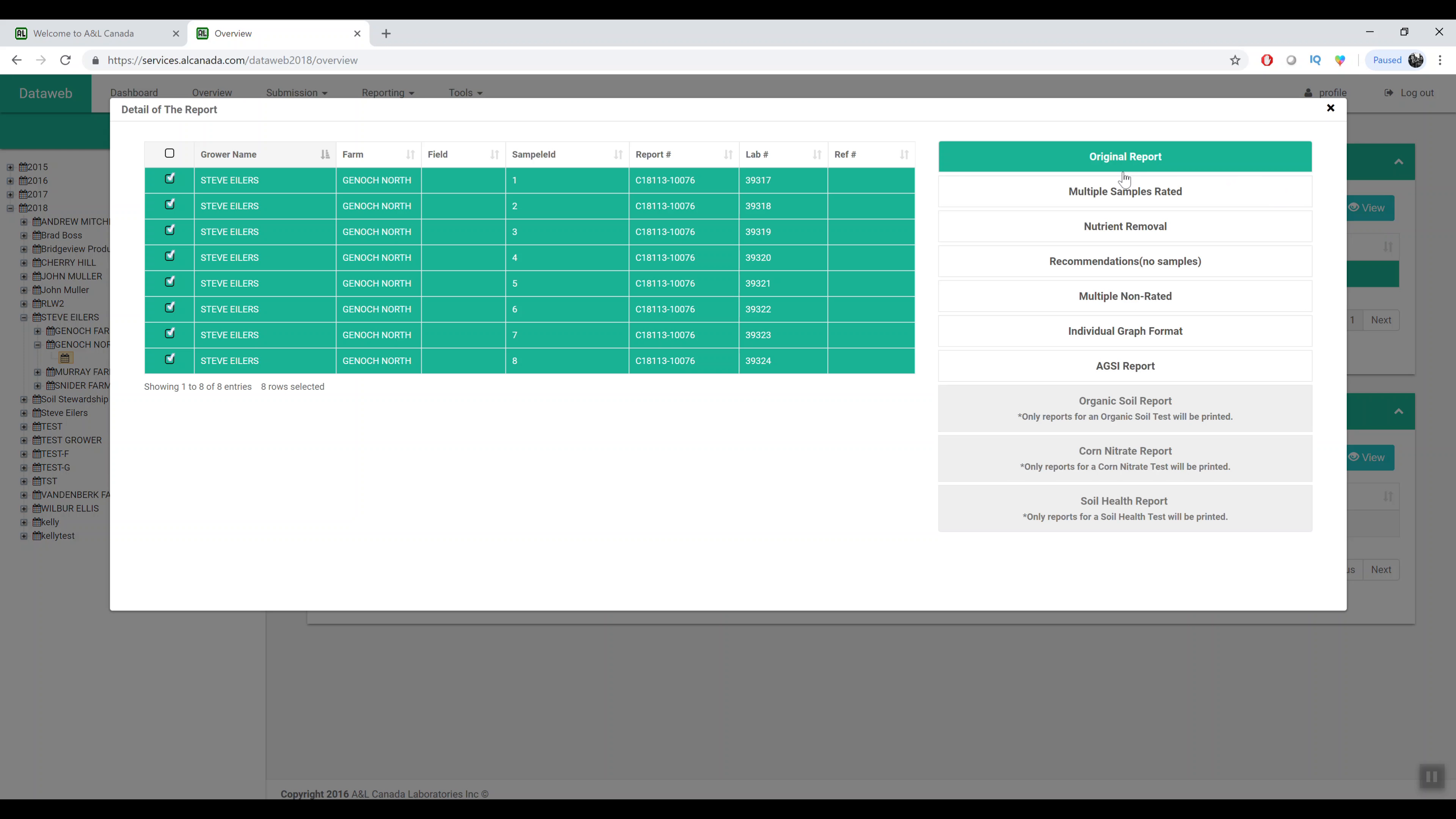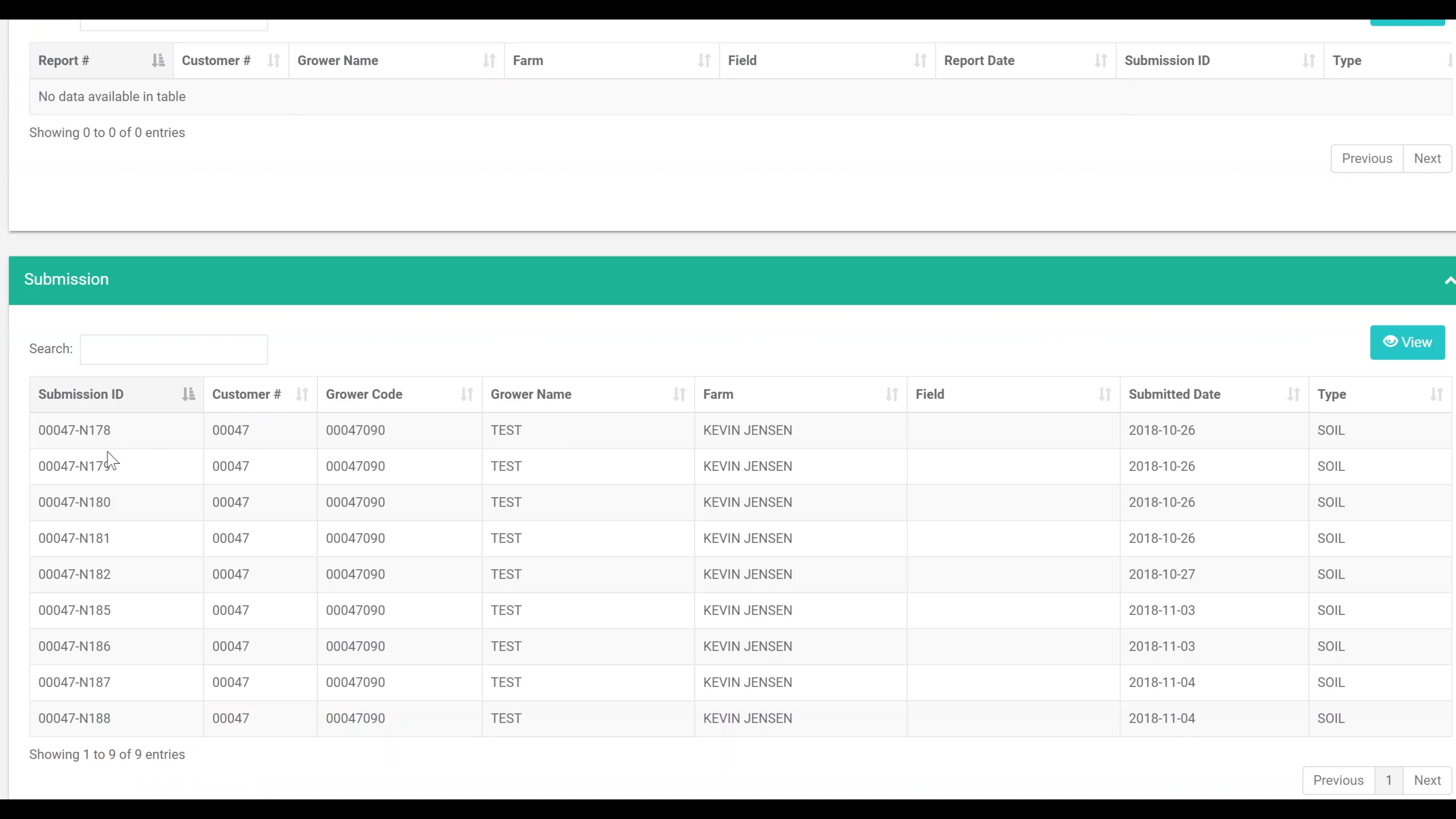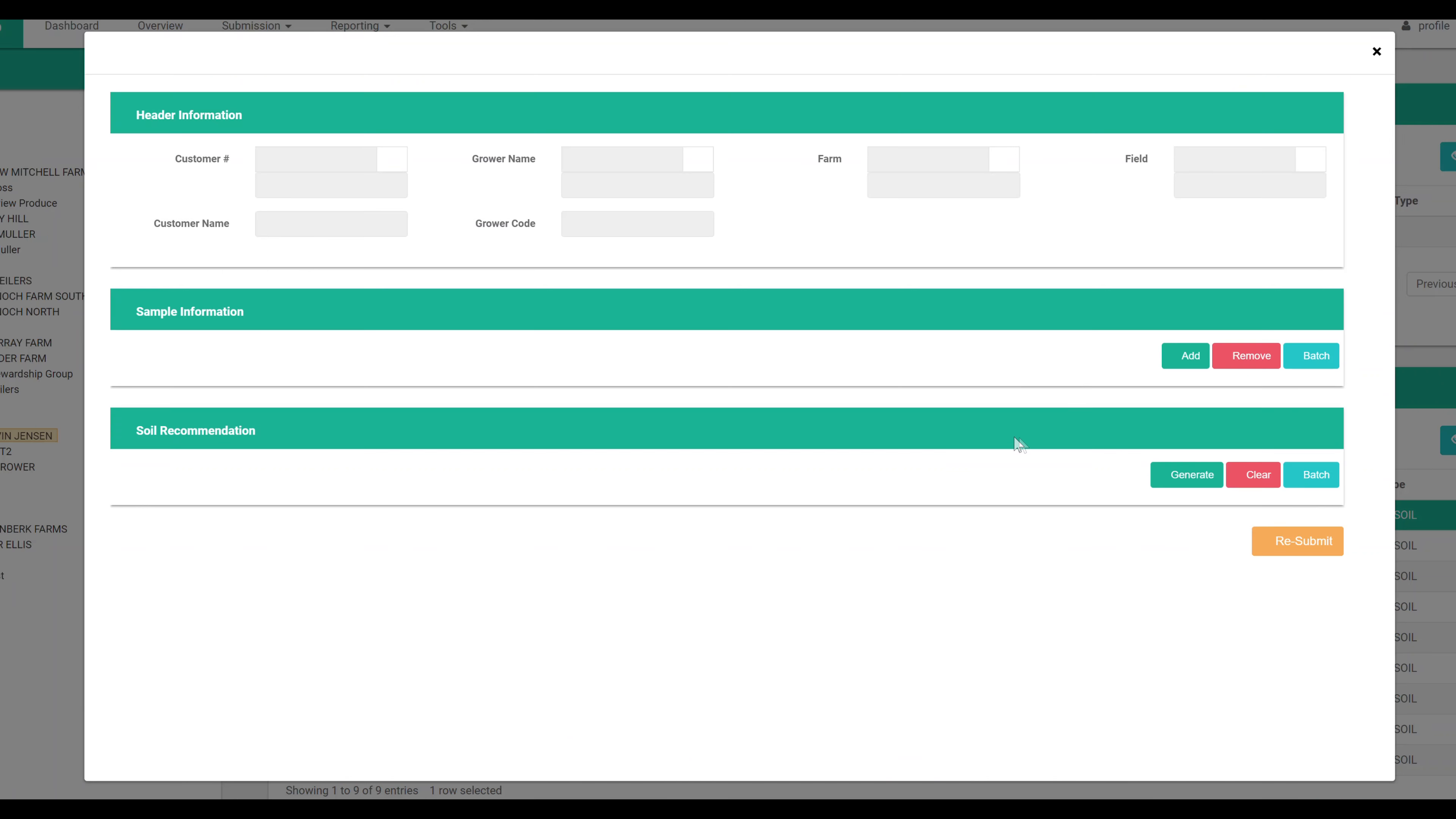From here you can view that report right from the overview tab. You can also view submissions right from the overview tab as well.